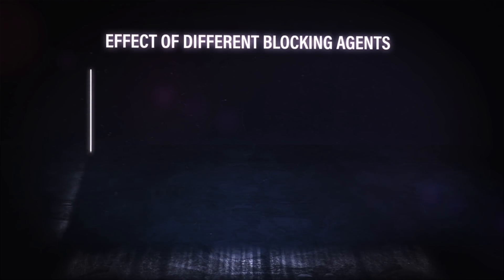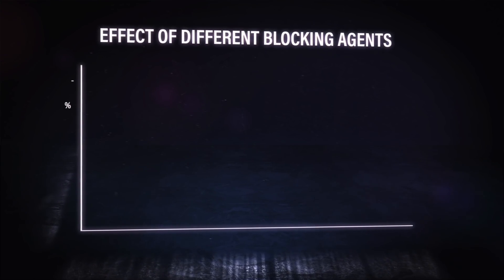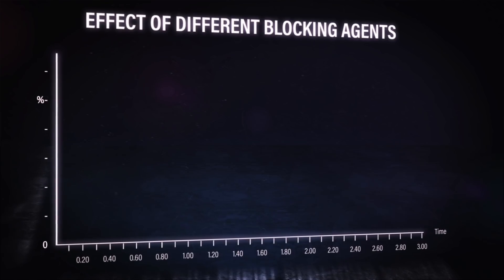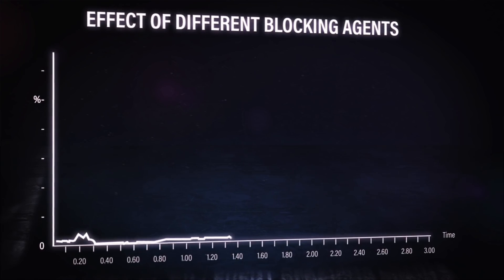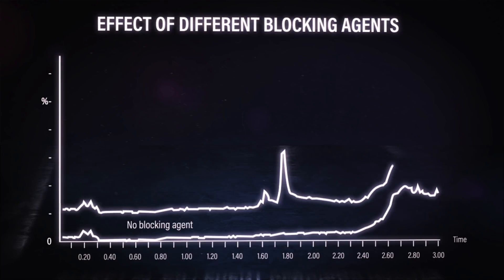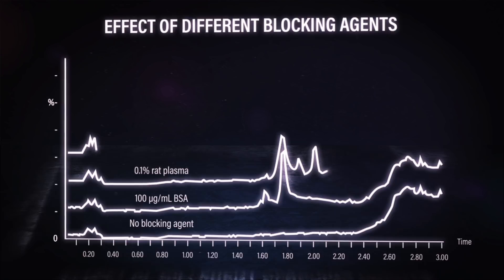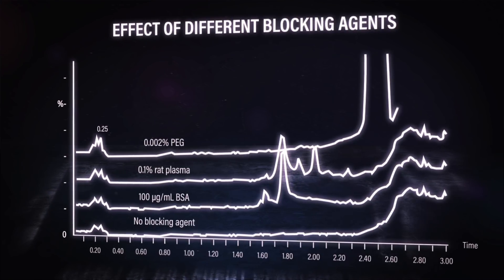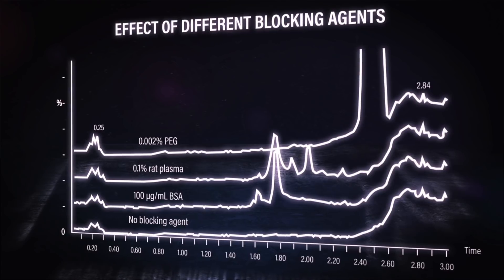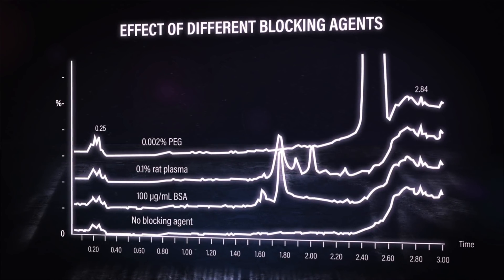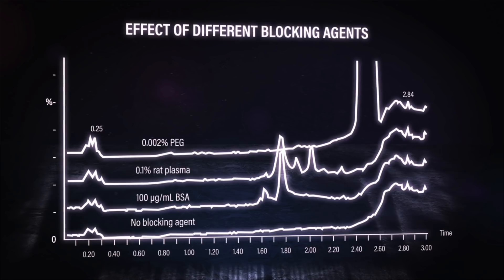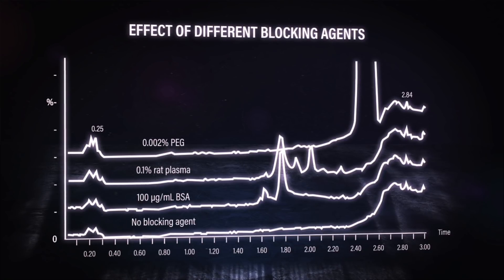We ran some experiments. I took a clean eluent and spiked in some protein and even a surfactant just to see how the background changes. From these four scans, you can see with no blocking agent, not much in there — looks pretty clean, that's what you want. But when you start doping stuff in there like BSA, rat plasma, or polyethylene glycol, you start to see a bunch of extra peaks. That is not good, because usually when you're doing this type of analysis you're trying to concentrate your sample and see low levels. Adding these things definitely adds extra interference to your chromatography and your mass spec.